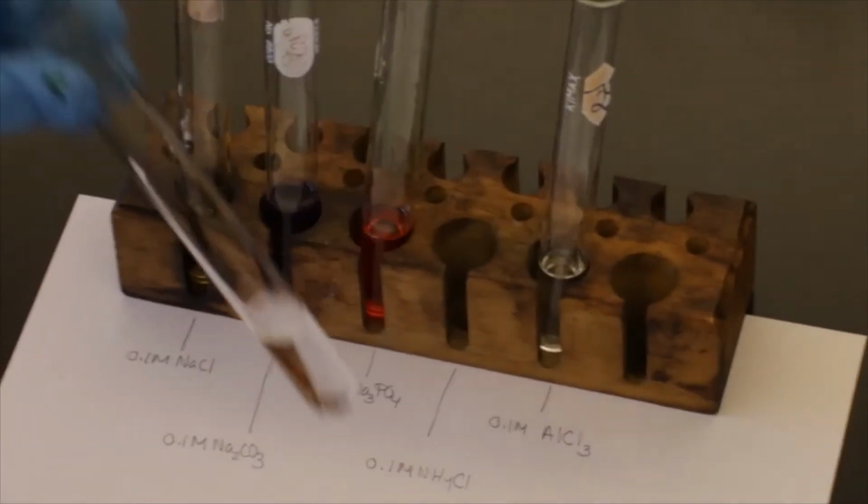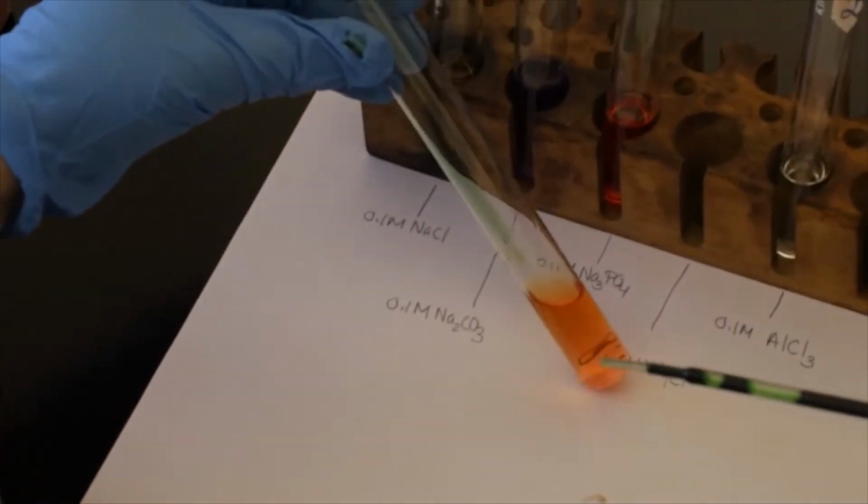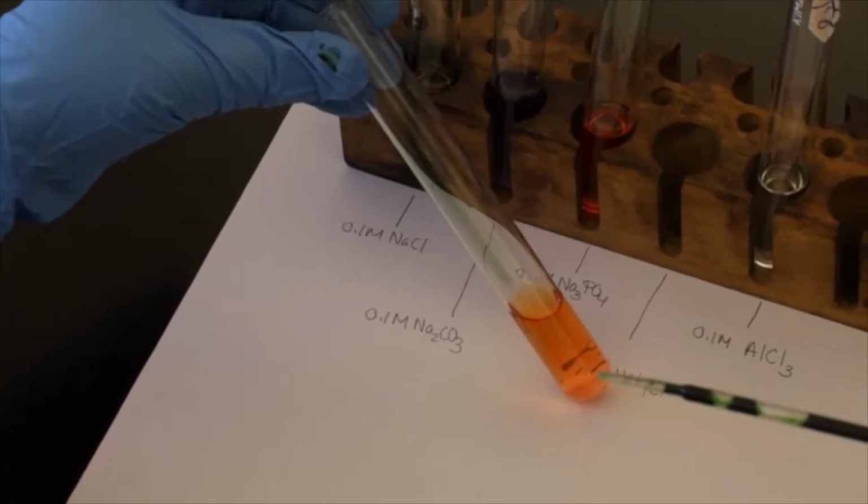Now we're going to add NH4Cl. We'll add our few drops in. We have an orange. Nice carrot orange. And AlCl3.